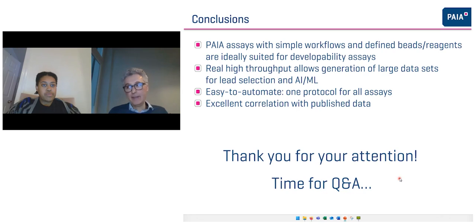Yeah, that is one question that I addressed very early in the presentation. So polyreactivity is the term that we are using, and this was also something that was proposed. But I know that people use those terms interchangeably. So polyreactivity for us means really weak interaction with all kinds of molecules and surfaces that are in the body. And polyspecificity is really a completely different thing, when a molecule is binding strongly, potentially, to a completely unrelated target. And for that kind of analysis, you need protein arrays where you know exactly which, for example, receptors you bind to. That is polyspecificity.